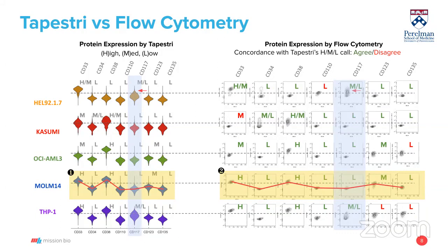And I might also add that in all these experiments, all 5 cell lines, the protein staining and then sequencing of the tag are done along with the DNA sequencing in the single cells as well, all within one experiment. So there are a lot of parameters here. It all fits in one experiment.